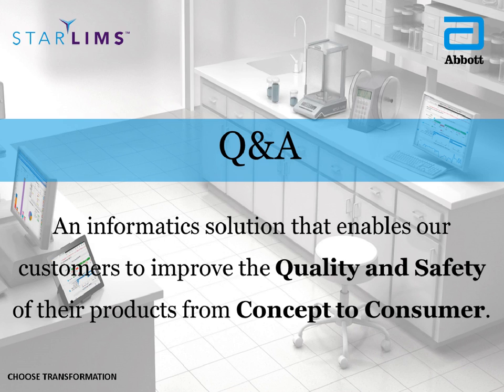Okay, thank you, Carla. The next question: on average, how long does it take to implement an external interface with STARLIMS? That's a great question, because we have to do so many interfaces, and I can tell you that it varies, but it can be as fast as 1 week, and sometimes it could take 2-3 weeks. I would say that would be the average. Now, it depends a lot on the external system. For instance, when we had to do an interface with Hamilton in a prior implementation, we were thinking it would take a lot more time, but in a week it was done.